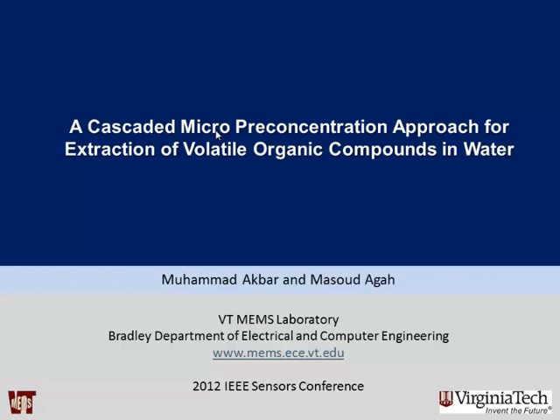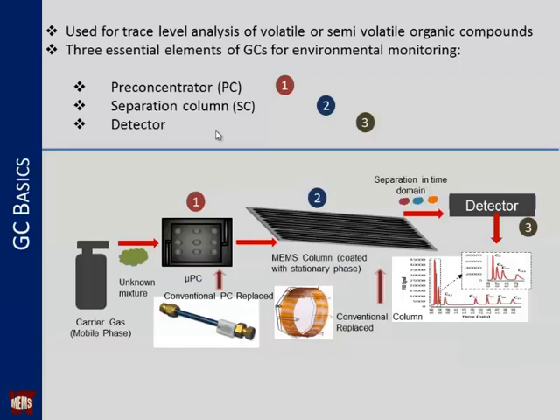Thanks, everybody. I want to talk about the extraction of volatile organic compounds, or VOCs, from water. Detection of VOCs is really critical for the environment, and they can cause major health effects if the concentration is above the limits identified by the EPA, the Environmental Protection Agency in the US.